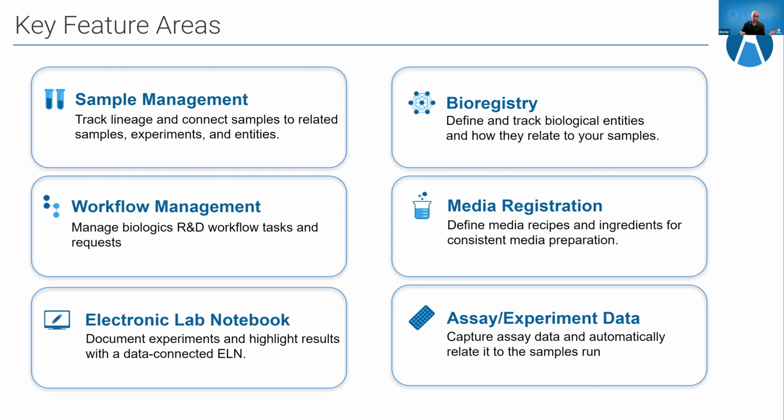As you heard from Sydney at OHSU yesterday, they had a variety of sample types, and I heard somebody ask about why they chose the ones that they did. You get to define all of those types. You get to define their metadata. You can capture the lineage within those samples, examine the chain of custody and history of those samples and their locations, and manage your samples in freezers, your sample inventory.